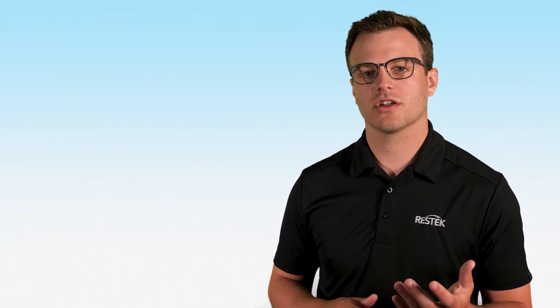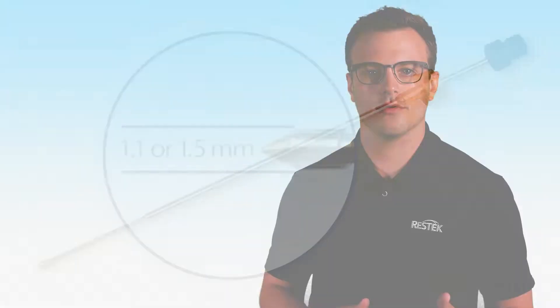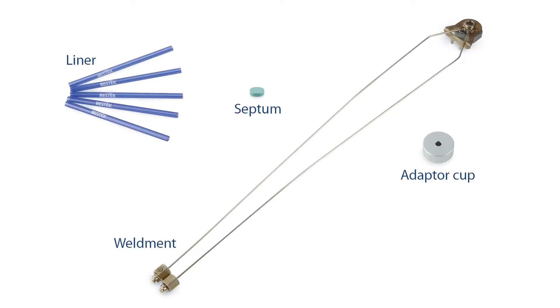The first step is to select the correct SPEMI Arrow conversion kit that's specific to your GC. This kit contains several critical pieces to accommodate the larger diameter of the SPEMI Arrow. The contents of your kit will vary by instrument, but it typically includes the weldment, adapter cup, liner, septum, and septum nut.